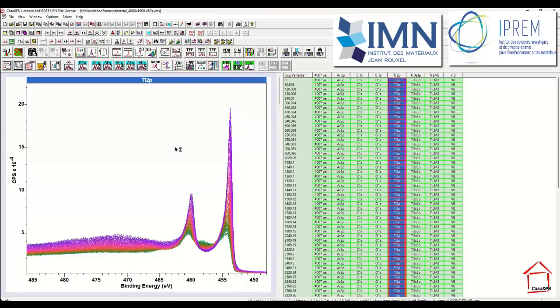The idea there being that we enhance signal and suppress noise by only using abstract factors that include signal, and they may also include some noise, but if we can identify all the abstract factors that are definitely noise and exclude them from the calculation, we will reduce the signal to noise problem within the data.